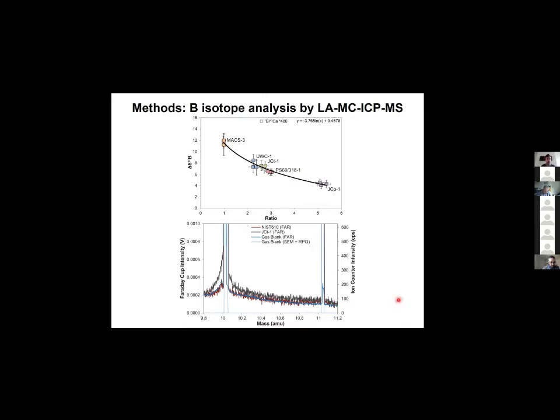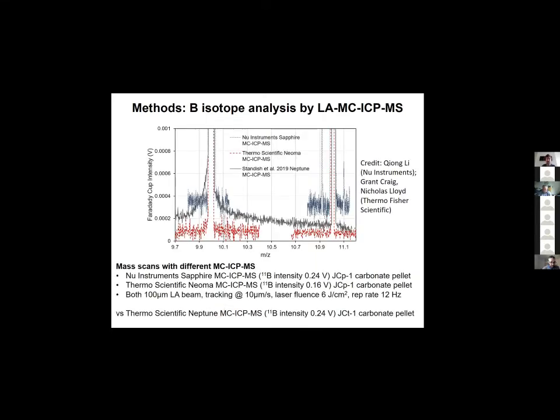And I set up an approach that utilizes this relationship to correct for this matrix interference, and we get accuracies and precisions to about 0.6 per mil. Now, this doesn't explain why some studies report no matrix interference, but this can be explained by it being a model-specific issue, relating to the design or geometry of the mass spectrometer, something like a flight tube.